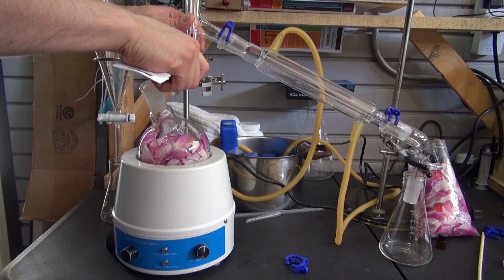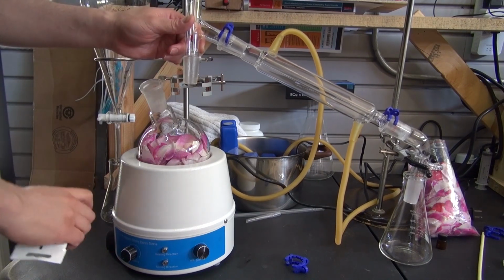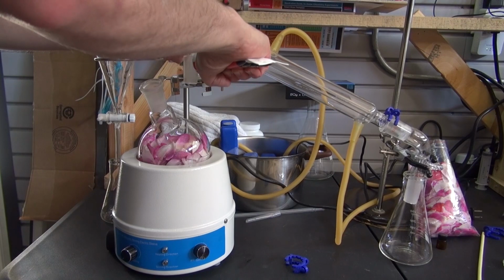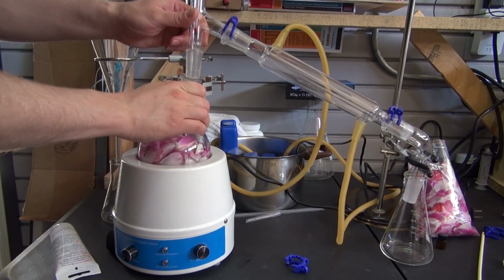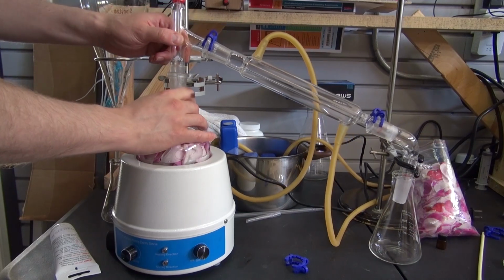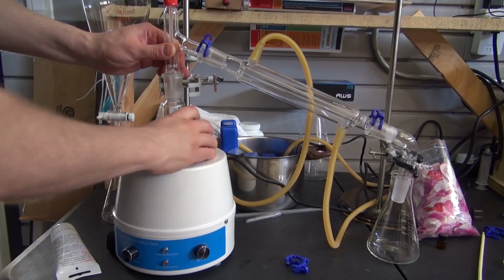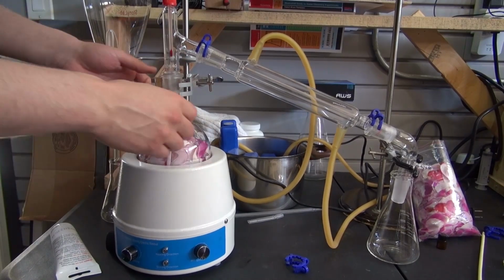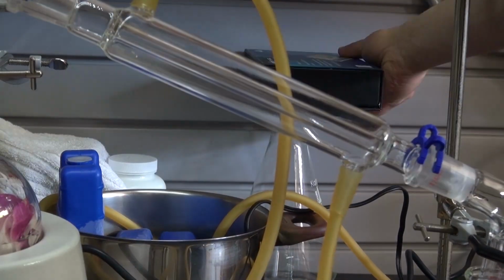And now it's time to put it on the heating mantle and attach the joints together, and let's begin the process. Put a little bit of vacuum grease, just like this. Attach it together. Twist the Florence flask just like this to make sure the vacuum grease is spread around the joint perfectly. Attach the joint clamp and attach the clamp together.